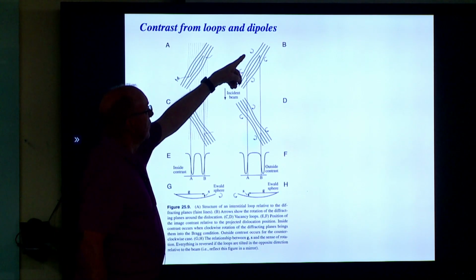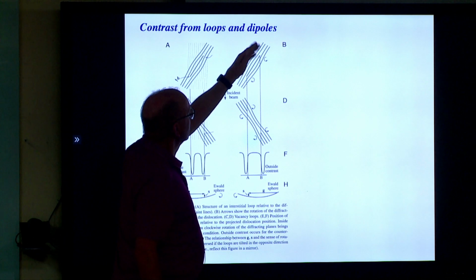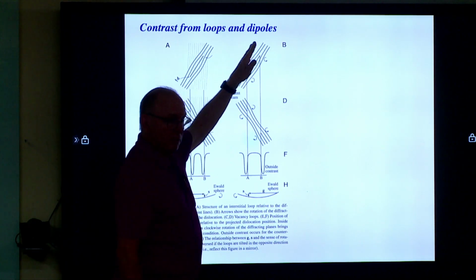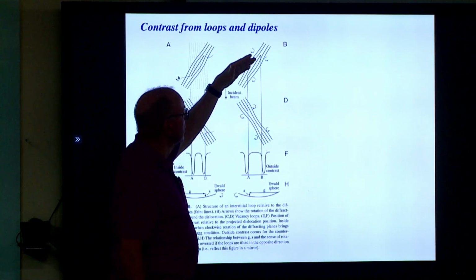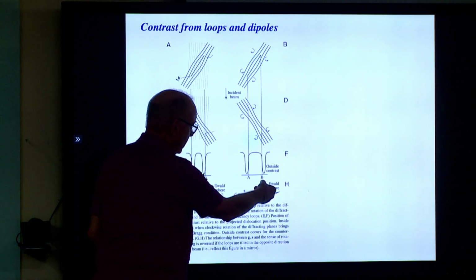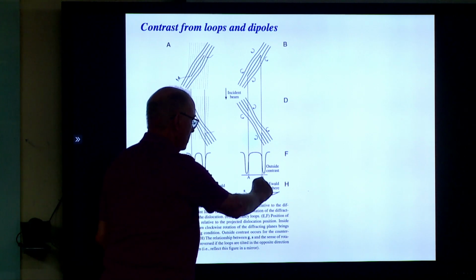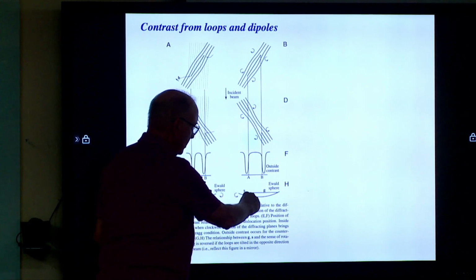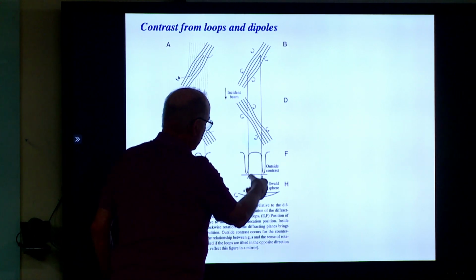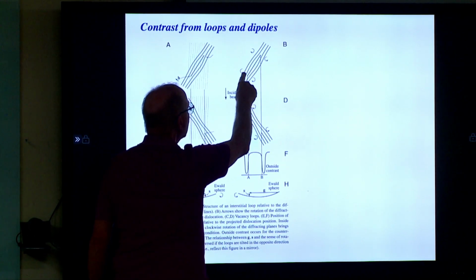These little twisty signs here are when the beam comes down and it sees this here, what it's seeing is that that's happening to the plane. That's the twist that's happening to the plane. And here, that's happening that way around. And if we look at the G vector here, anything that looks like an anti-clockwise thing is going to push this G vector into the Ewald sphere. And then we'll get diffraction. So I'm looking for anything that does that. So that would give rise to the diffraction.